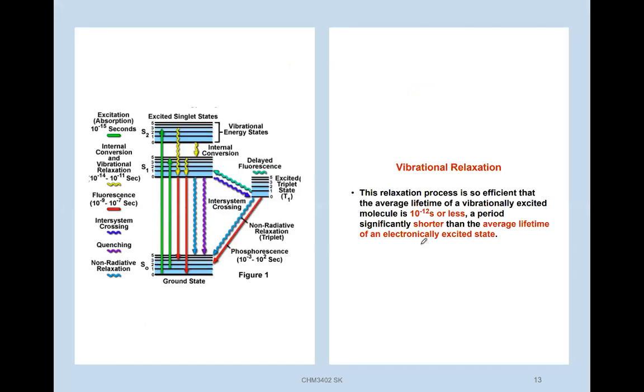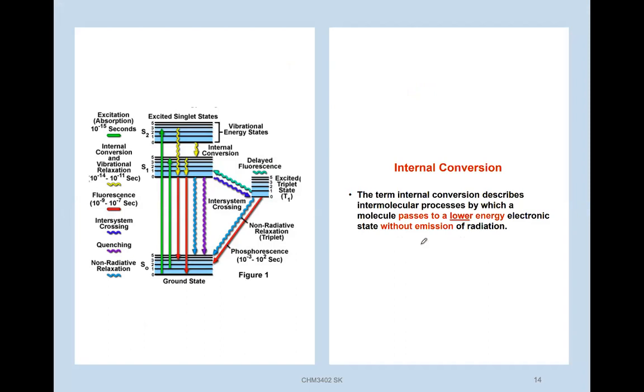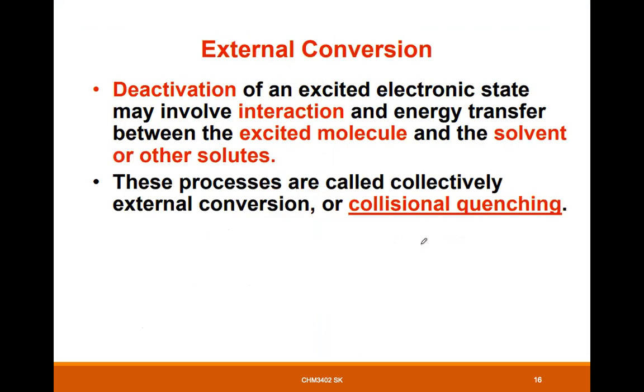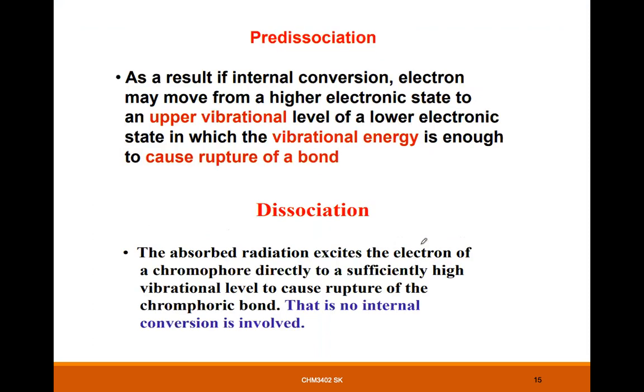Right. Okay, so these are the details if you want to go through what is vibrational relaxation. This is just repetitive, but in a more detailed picture, right? Internal conversion, what happened, and the dissociation of the atoms just now.